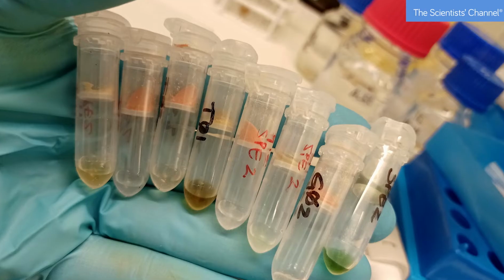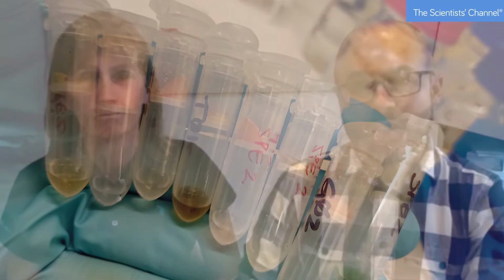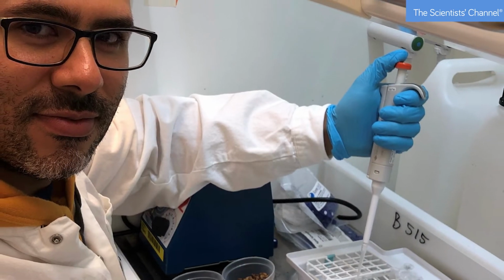We have been relying on the Orbitrap technology, a platform that has been widely applied in several laboratories, just like triple quads, but also for full scan and triggered tandem modes that lead to high quality spectral information. I am particularly focusing on ochratoxin and acrylamide, but the plans are to expand the scope with other relevant analytes such as more mycotoxins, along with pesticides and contaminants of concern that can be applied to other products using a simple and environmentally green alternative.